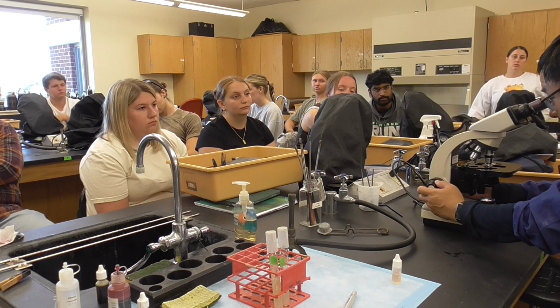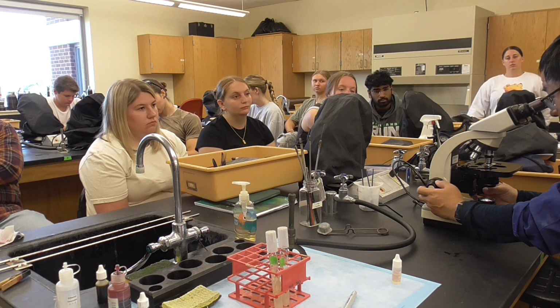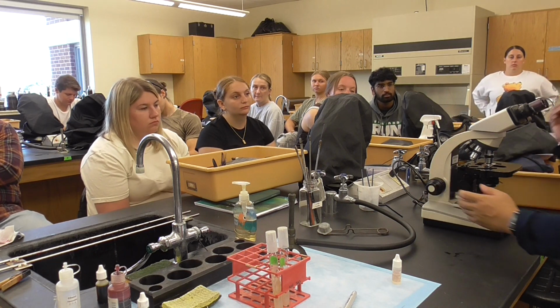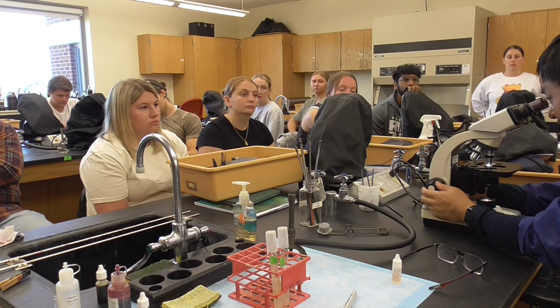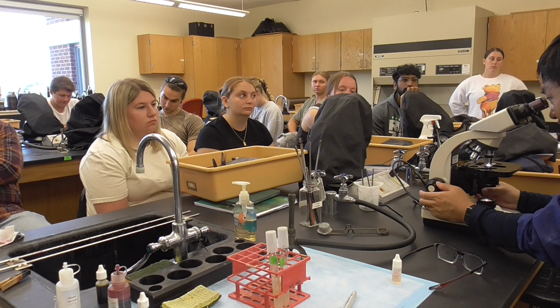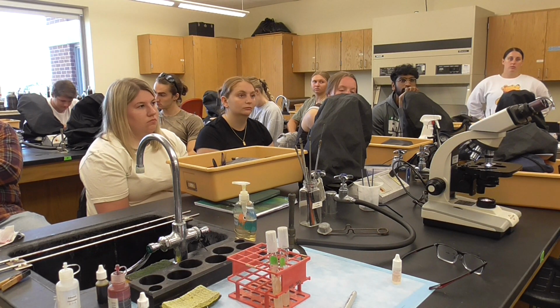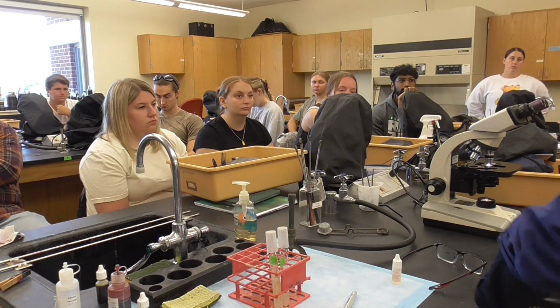It's supposed to be gram-negative, but we find it's a mixture of the purple color and also some pink color. So it looks like this pathogen, this E. coli, could be cross-contaminated. It's large, and you see a lot of pink color there, but you also see lots of the crystal violet color. Can you go ahead and see it? Is that right? Some pink, some still purple. So it looks like it's a mixed culture.